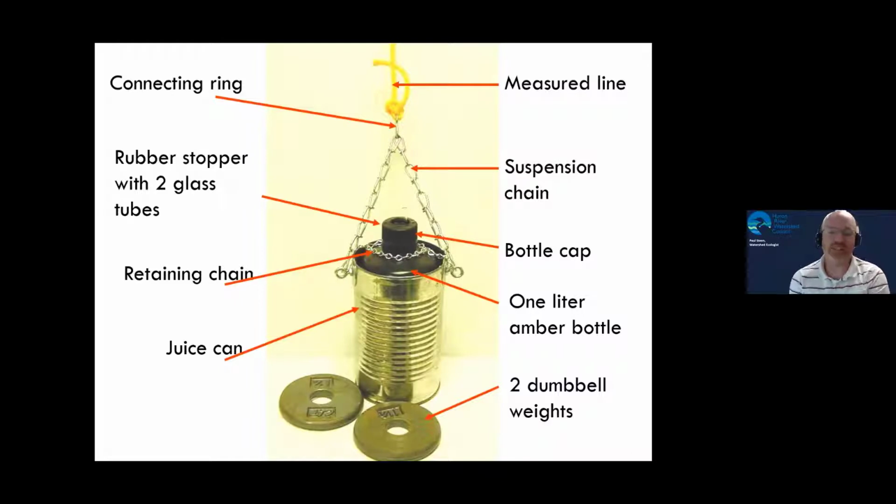Now, another thing that you will need to provide for this is a rope. We will not provide the rope for this. So that's something that you will do, and you want to make it a measured rope. With a heavy permanent marker or perhaps electrical tape or other kinds of tape, you can mark off 1 foot increments on your rope. And you'll want to do that far enough that it's approximately double your normal Secchi depth, because that's how far you're going to end up dropping this thing.